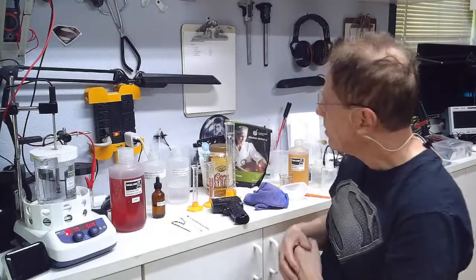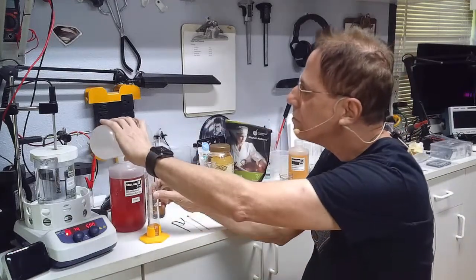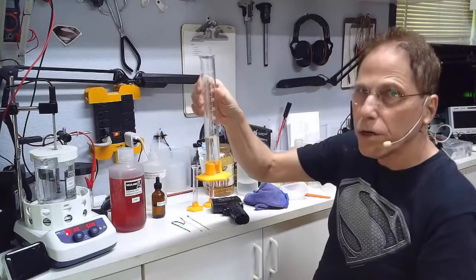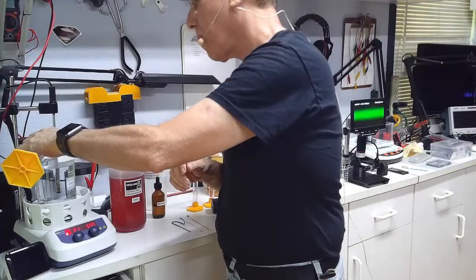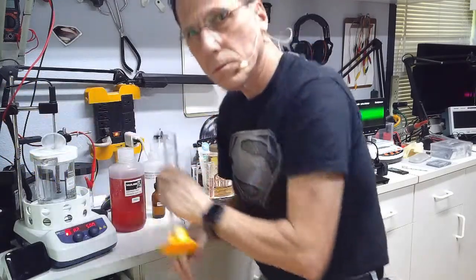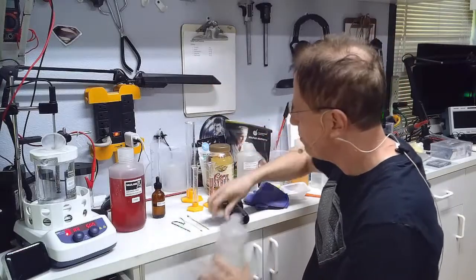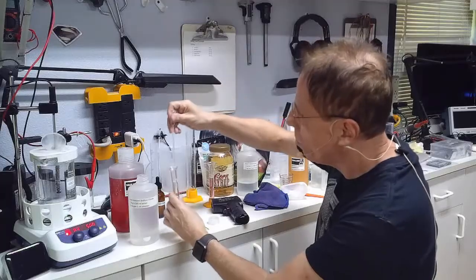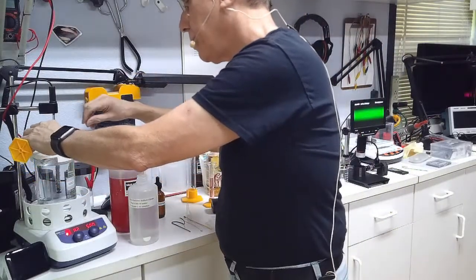First, corn syrup: we're going to put eight drops of corn syrup in here. Next, we're going to put 40 milliliters of NaCl — using a handy funnel to make sure it all goes in. Next, we're going to put 10 milliliters of sodium citrate. If we get any spillage that's what pipettes are for — we suck out what we don't want and carefully add the 10 milliliters.